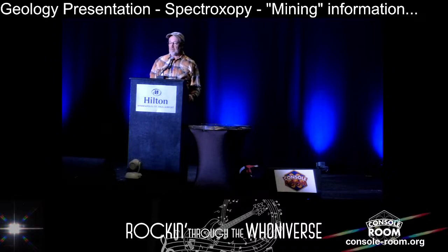And I would love to have that on display where we have it in leaded glass, and then you push a button and the Geiger counter goes off. That would be some work to do that properly, though. But you could get in touch sometime and I could probably share. I have geo standards, we call them, that have radioactivity in them, and I could probably share some of that with you.